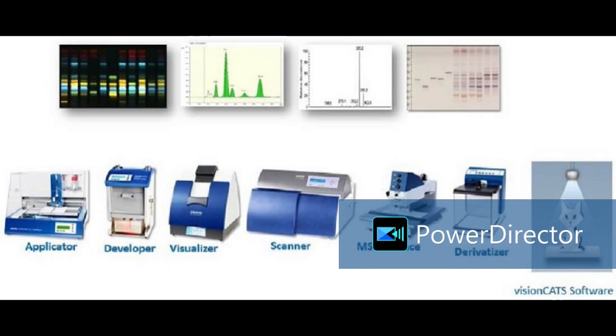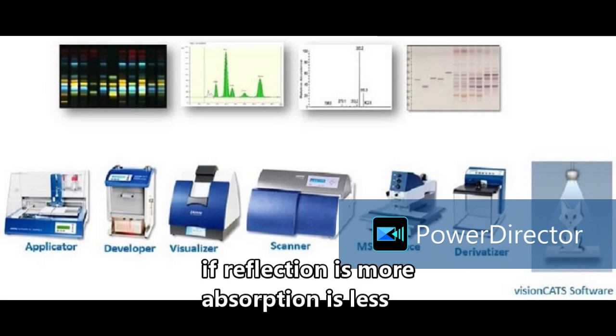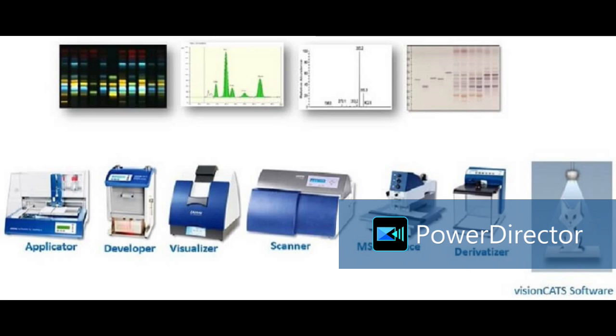So it is based on diffuse reflectance. If reflection is more, then absorption is less. Reflected light is more, then absorption from the band is less, so the area of the band will be less. If reflection is less, then absorption is more. In that case, area is more. So depending on the amount of compound, it will absorb the light or reflect the light.